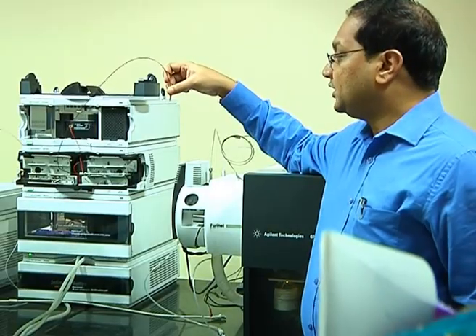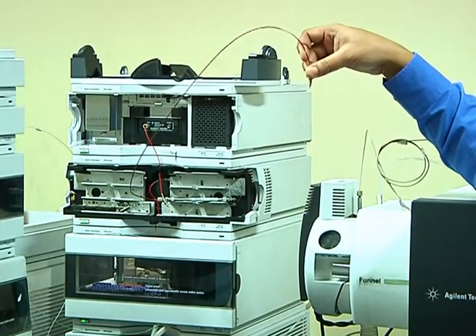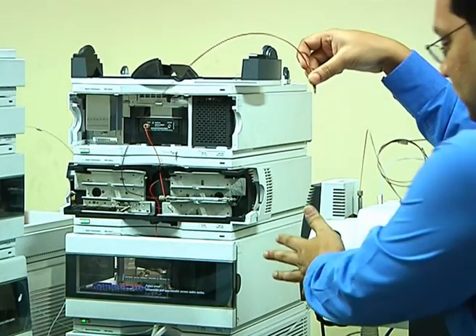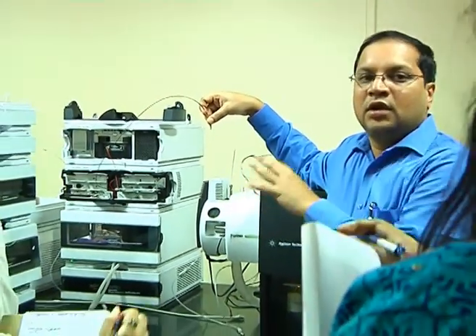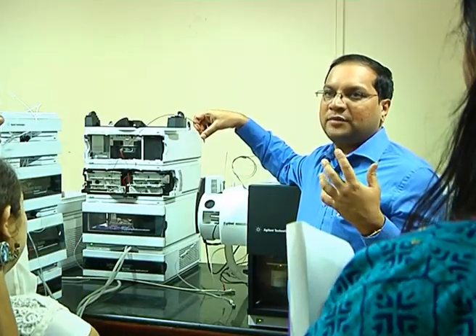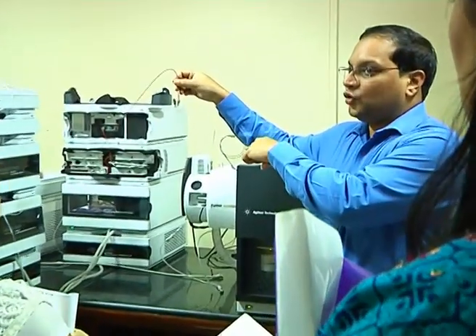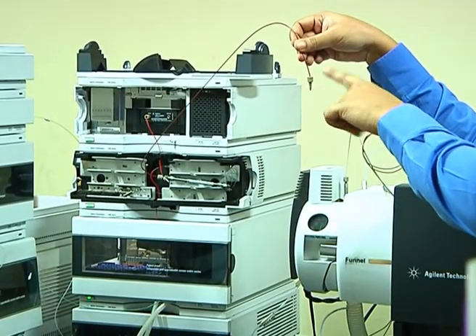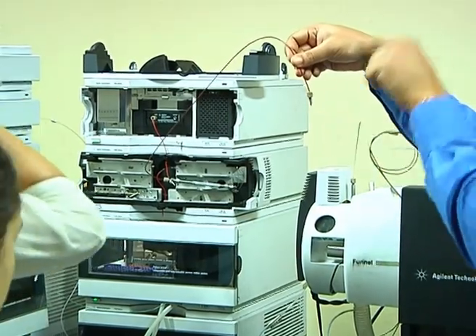Right now the method is running at 0.4 ml per minute. The flow rate is 0.4 ml per minute. You can go to 1 ml per minute, but of course with this source only. I am not going into the details of the specification of this particular source, but for other sources, MS in general, you may not be able to go beyond 0.5. Right now, at the initial stage, when I have to load the sample, the flow is 3% organic and 97% aqueous. So more of water right now because I have to inject the sample.